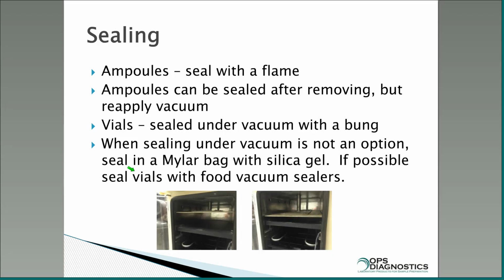After your sample, whether you do a vial or an ampule, people even use vials with little screw caps, for instance. You can throw them into a Mylar bag with a little silica desiccant and a seal-a-meal bag, and seal them that way if you're concerned that your mechanism for sealing is not that accurate. Those systems can seal out the water very effectively.